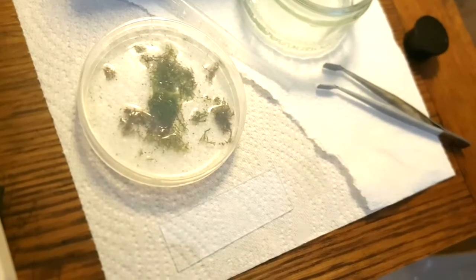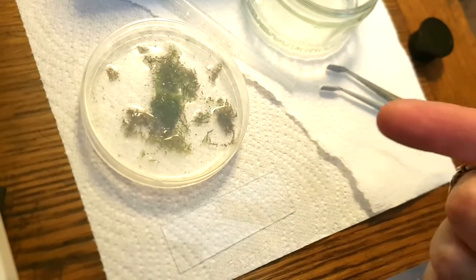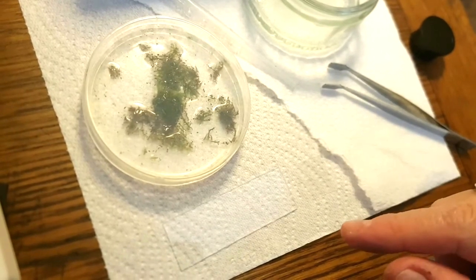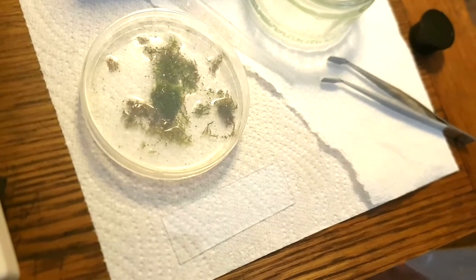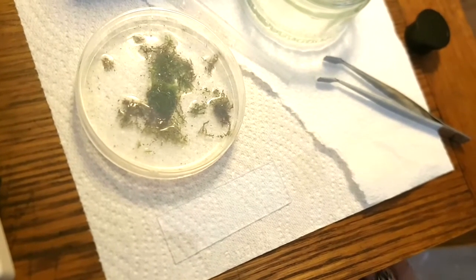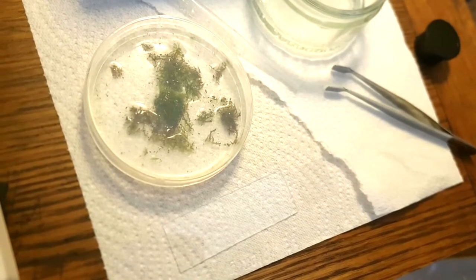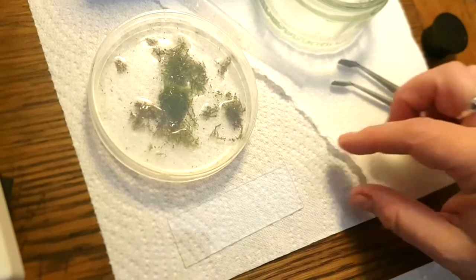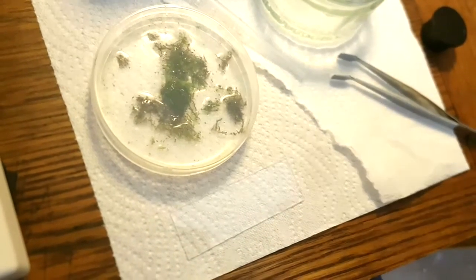Now, what I've done every time I've looked for tardigrades in the past is to just get the pipette and suck some water up and stick it on the slide and then just start having a look around. But actually, it's better for the microscope and the optics of the microscope, as well as keeping things in one place, if you put a cover slip over the top, because it will stop things from running out of the field of view quite so much.